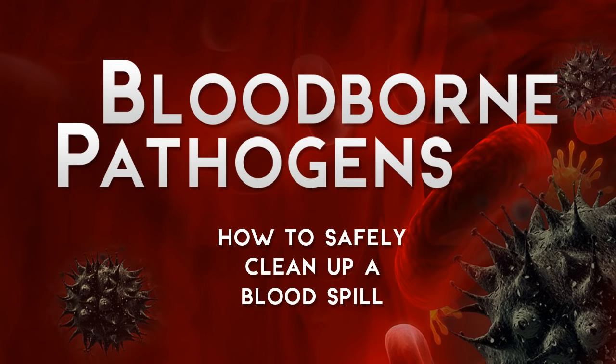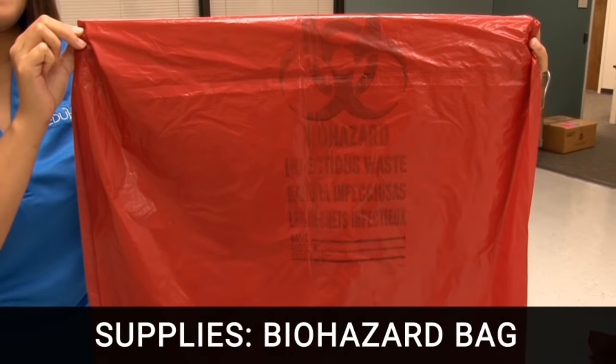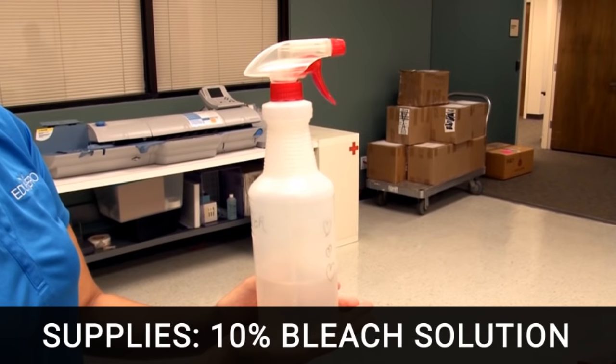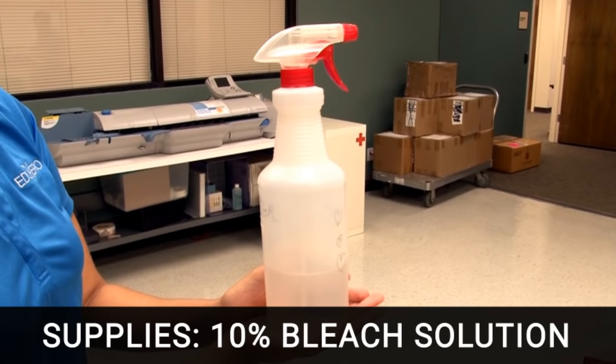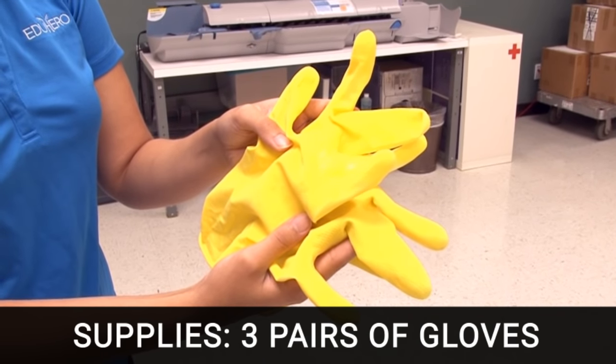Here's how to safely clean small blood spills and decontaminate the area. The supplies you are going to need are a biohazard bag, paper towels, a 10% bleach solution in a spray bottle, and three or more pairs of latex or other gloves.